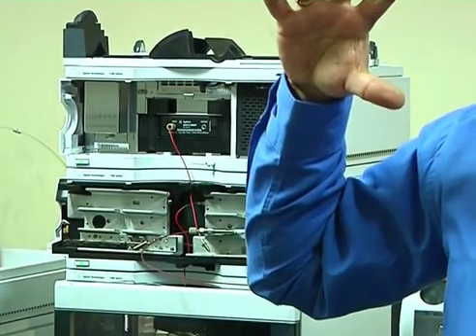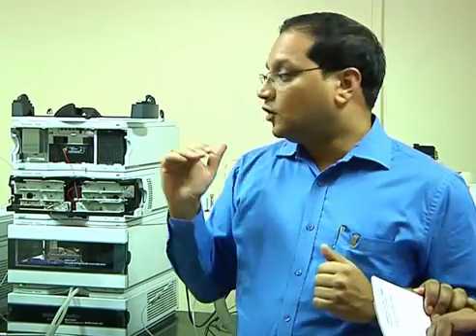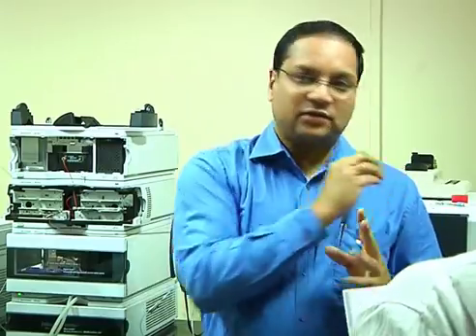Typically there are two pumps, as I told you. Pump A consists of water with formic acid, and pump B consists of acetonitrile, typically with 0.1% formic acid. So why formic acid? To give protons. Why so? Because I know my analytes are peptides, which have many amide groups that can take protons and get charged. And I know the basis of mass spectrometry is what? I need charge, mass to charge. Unless my analyte is ionized, the MS is blind. It cannot see. So the prerequisite of an MS analysis is that your analyte must get charged. In electrospray, typically your analytes get ionized in solution, meaning in the solution itself it gets protonated, and ESI generally facilitates the ionization. It creates an environment where your ions move into the MS suitably.